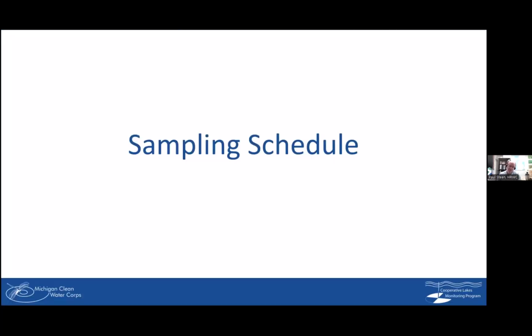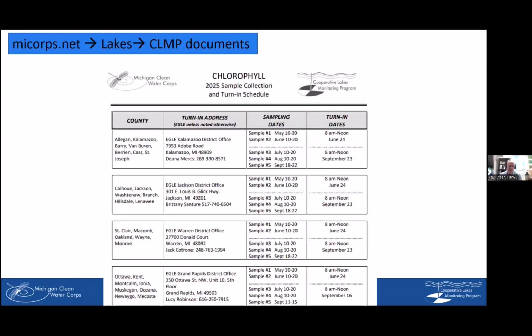So, like I said, it's a complicated system. So let's start going through what you need to know when it comes to measuring chlorophyll. Well, the first thing is you just need to know when we want you to sample. So here is just a screenshot of what our chlorophyll sample schedule looks like.